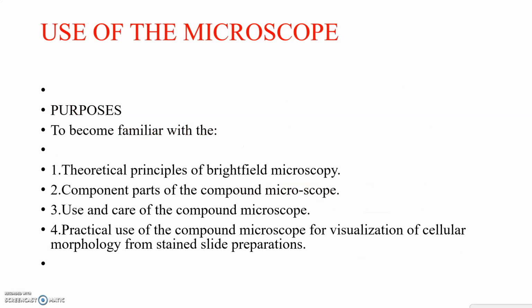Again coming to the use of microscope. That is to become familiar with the principles of bright field microscope, then familiar with the component parts of the compound microscope, use and care of compound microscope, and practical use of the compound microscope for the visualization of cellular morphology from stained slide preparations. So we are using, and last year we have already taken a compound microscope from the lab for the visualization and for the study of the parts. Are you remembering?